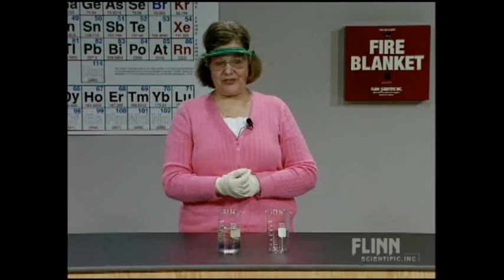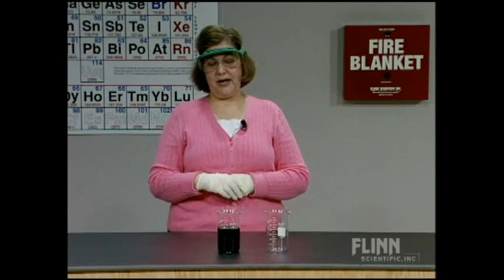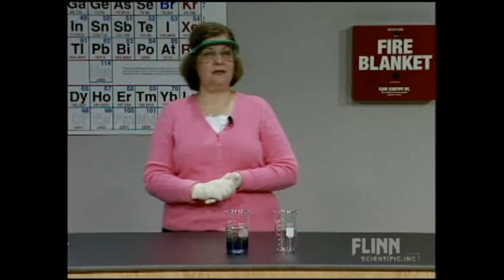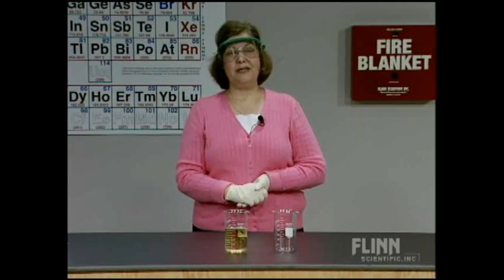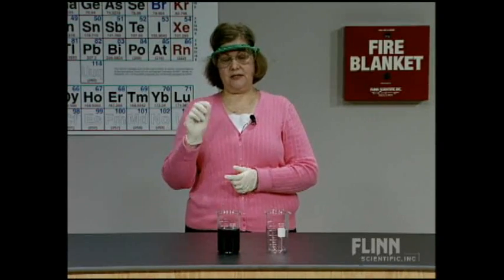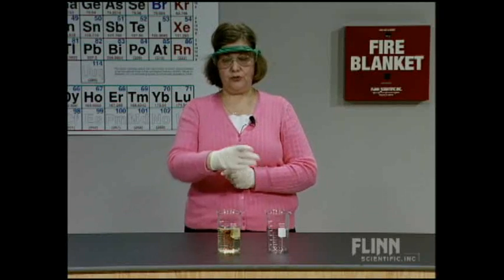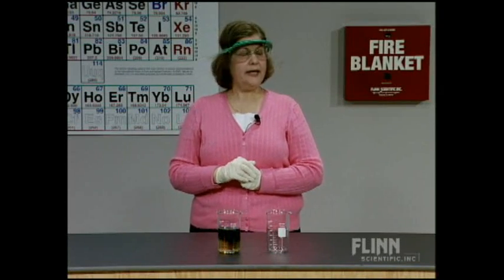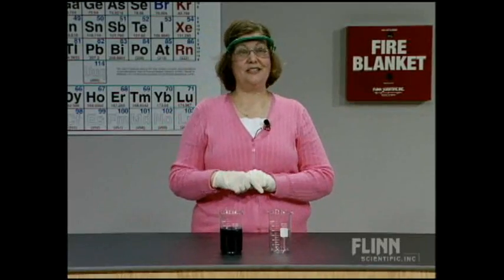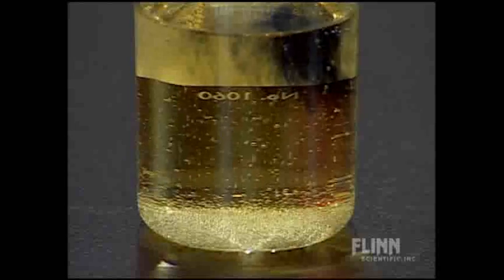You can see the bubbles now. You can see a lot more bubbles being produced. That's some carbon dioxide gas from the oxidation of malonic acid. Remember, we said the malonic acid was a carboxylic acid. It has two CO2H groups, and that molecule gets broken apart and you get some CO2 gas that you see there. Now remember I said that we had a hint that the third reactant had starch in it. So we're getting that characteristic dark blue color.